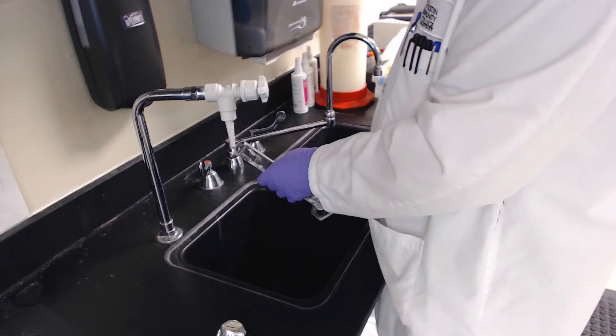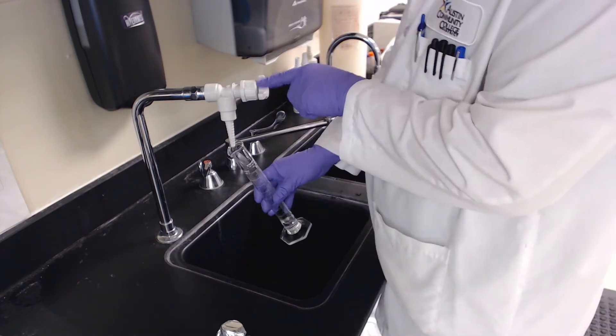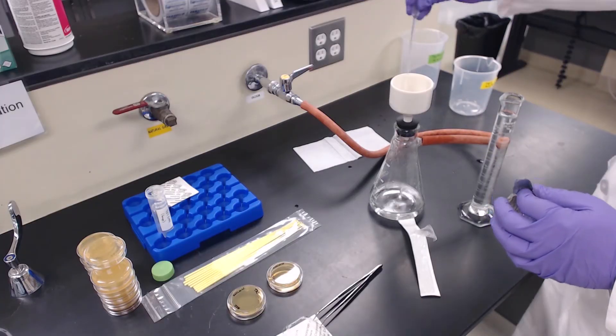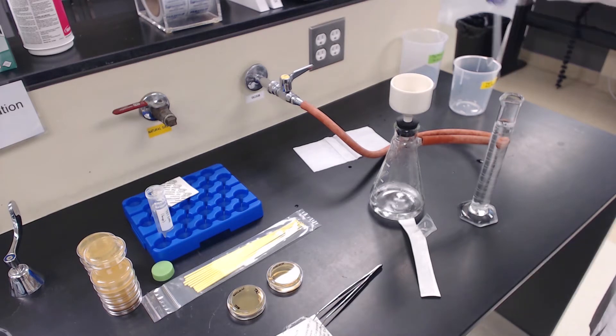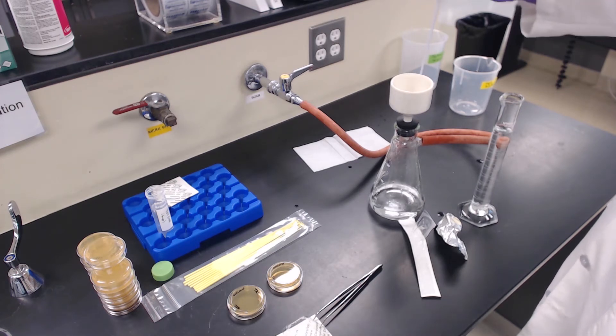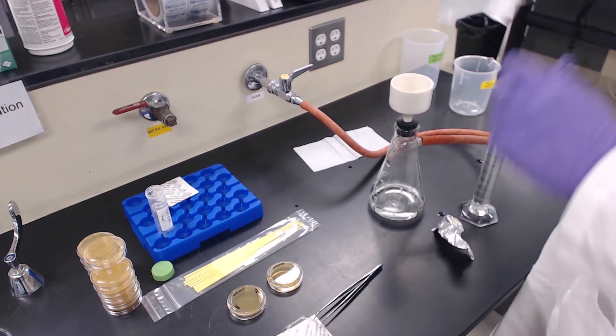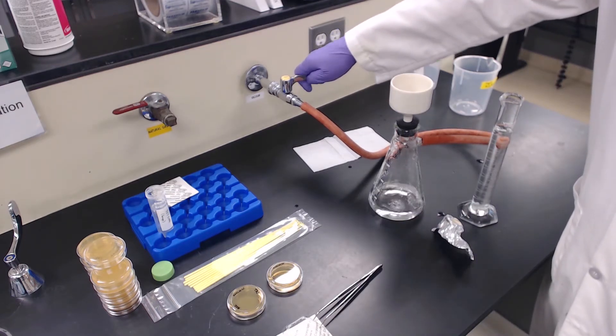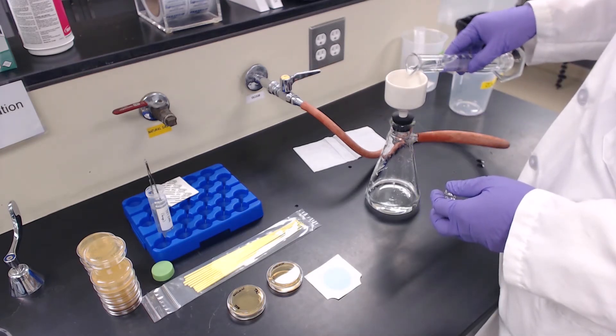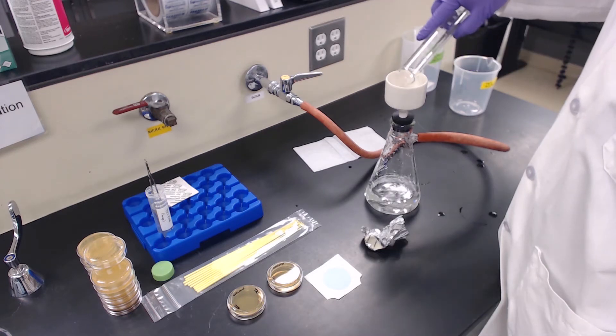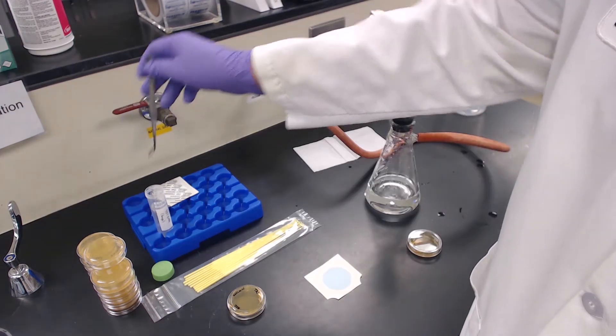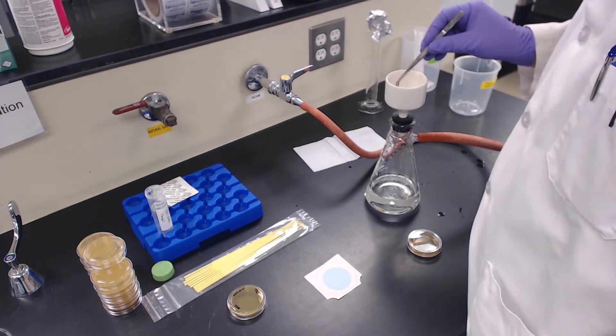Take your next water sample. Again, be sure to rinse the graduated cylinder three times with the sample before retrieving your 100 milliliters. Use some of the sample water to rinse the Buchner funnel to remove any of the previous sample water. You may quickly open and close the vacuum line to remove any residual water from inside of the Buchner funnel. Place a new gridded filter paper in the funnel and filter through the second water sample. Transfer the filter paper to the corresponding petri dish plate, grid side up.